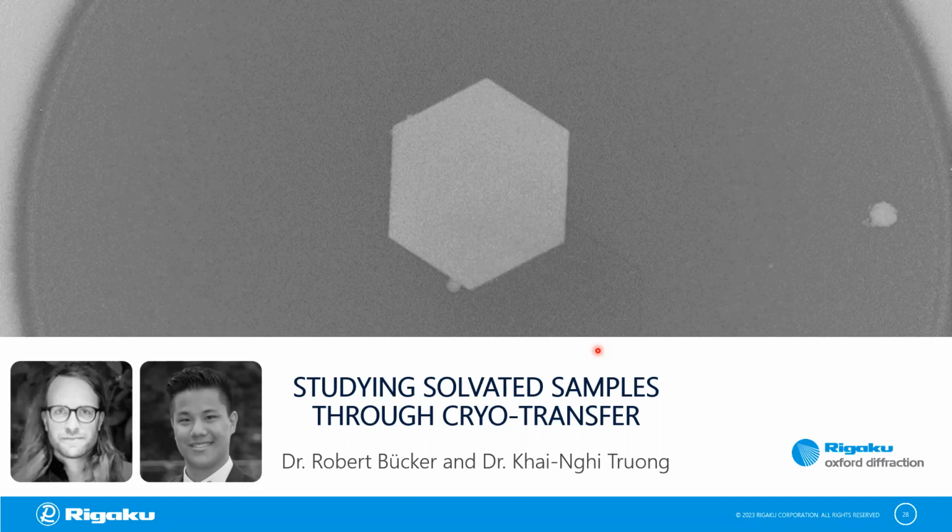Yeah, as Chris just mentioned, sometimes desolvation is an interesting phenomenon, but more often than not, you are not interested in how the environment of your diffractometer unavoidably changes your sample; you'd rather have your sample preserved in its native state. And for solvated or hydrated samples, one good way of doing it is by freezing your sample outside the vacuum, and then in the frozen state, introducing it into the vacuum of the diffractometer. Of course, the vacuum itself is unavoidable for an electron diffractometer, as the electrons would just stop in air. And then you measure it under these cryogenic conditions while it is protected.